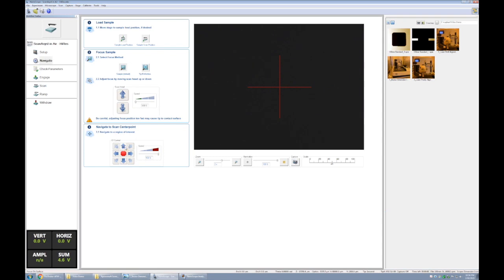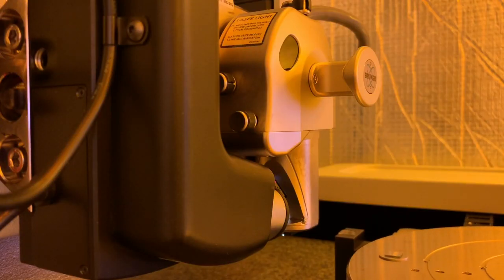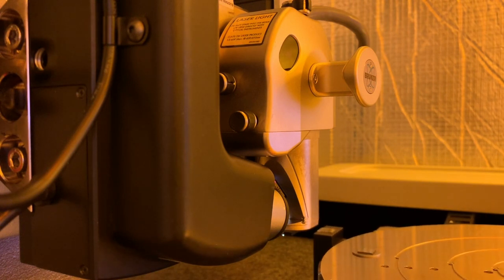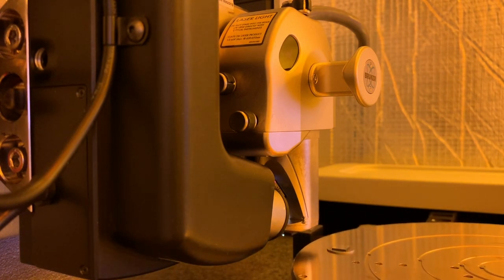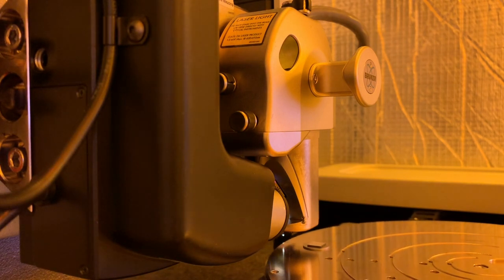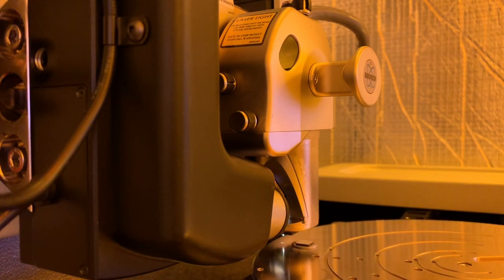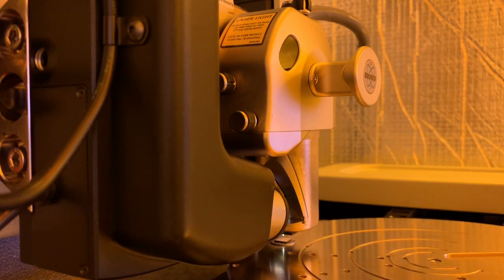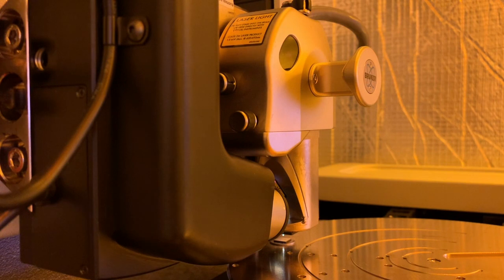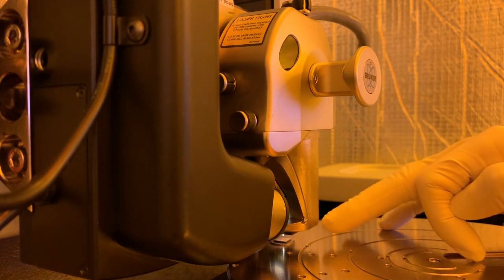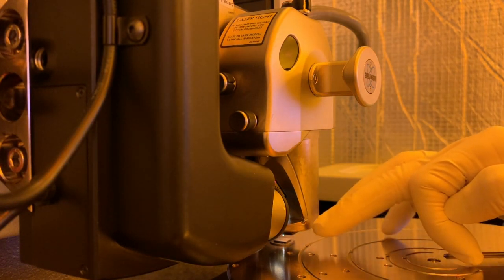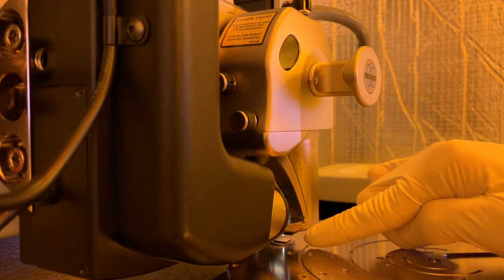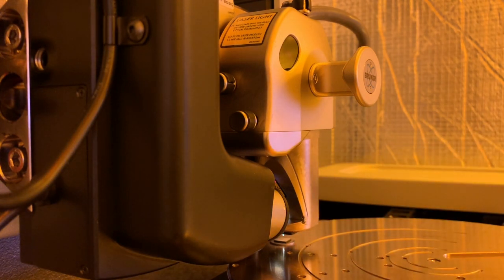We'll start driving forward, and we'll be able to see in the live video as the sample gets closer to the scanner. It's going to be a few millimeters away, and when we get our sample under it, hopefully we can see that there is a little light that shines down and it shows us where the scanner is positioned over the sample.